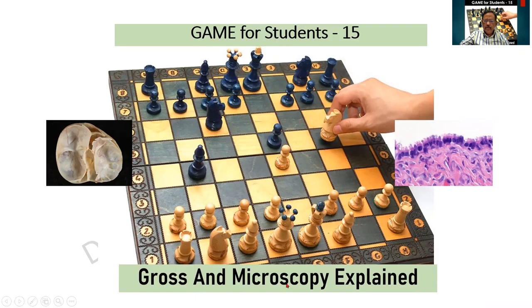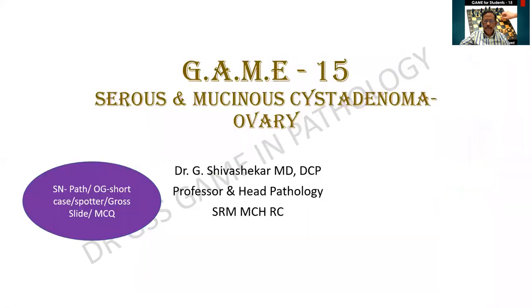Gross and Microscopy Explained. In this session, I shall be dealing with a couple of ovarian tumors which are important both as gross specimens as well as slides for you people. And the significance is given within the enclosure.